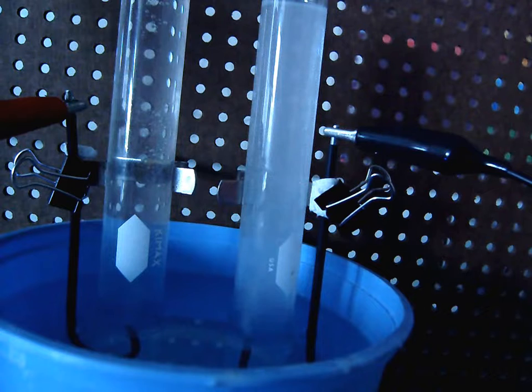So one of the gases, the one that is positively charged, is being collected in the test tube on the right, and the one that's negatively charged is being collected in the test tube on the left. That's how we separate them, by generating opposite charges. So when they break apart and they're oppositely charged ions, they go to their respective electrodes, and they essentially separate themselves that way. And because the electrode is placed directly under the mouth of the test tube, when it's attracted to that electrode and then turns into a gas, it will rise and be collected in the test tube. So that is what you're observing.